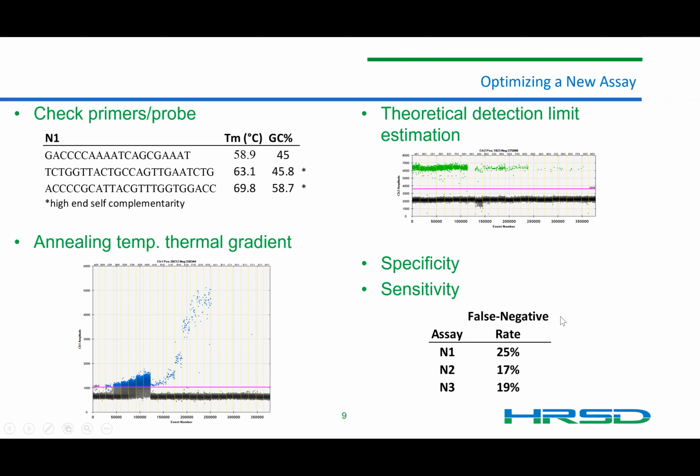But I'm not saying that this is what everybody needs to do. This is just the first basic steps that our lab does that we think is worth doing. And these can all be done for qPCR as well. Probably should be done for qPCR as well.